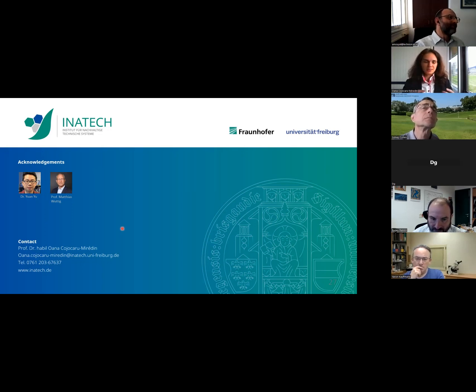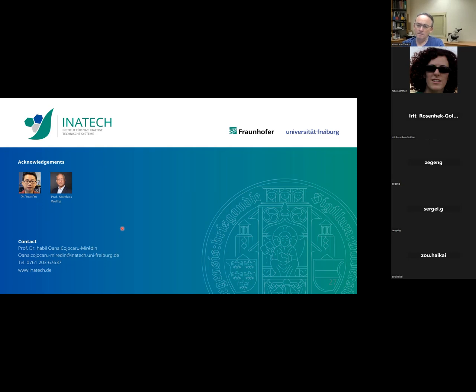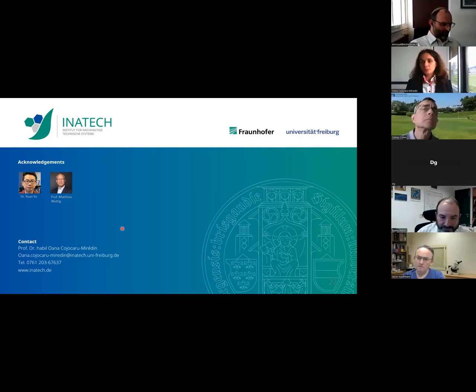So we typically use the TEM to check the quality and the crystallinity of our atom probe tips, and with the atom probe you can also check if you have gallium implantation inside the tip and how this can be reduced. So there is a really huge field. And I think this is the same with the TEM lamellas, of how to strongly reduce the contamination on the tip and to preserve the initial structure and the initial composition of our material.